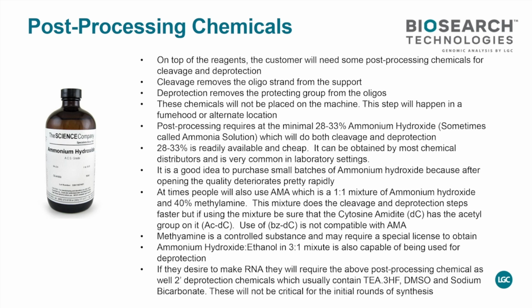And for RNA, there's also a secondary step if it's a traditional RNA, and it will have either TBDMS protection or different types of protection on the OH, then you will have to do it for the secondary step. And you need to keep your environment sterile after that, because the OH is where the RNases will attack and eat your oligo, destroy it.